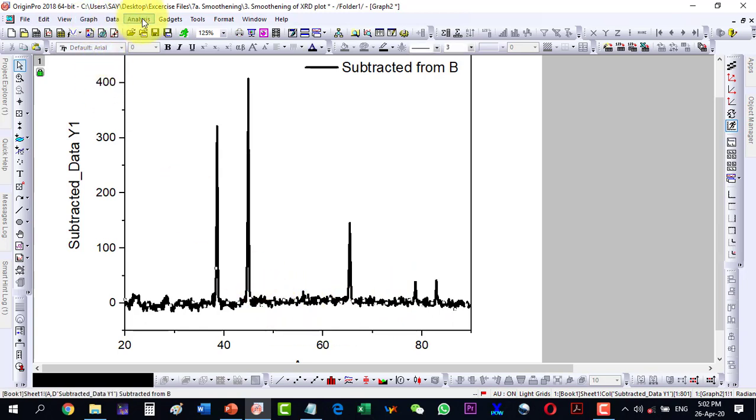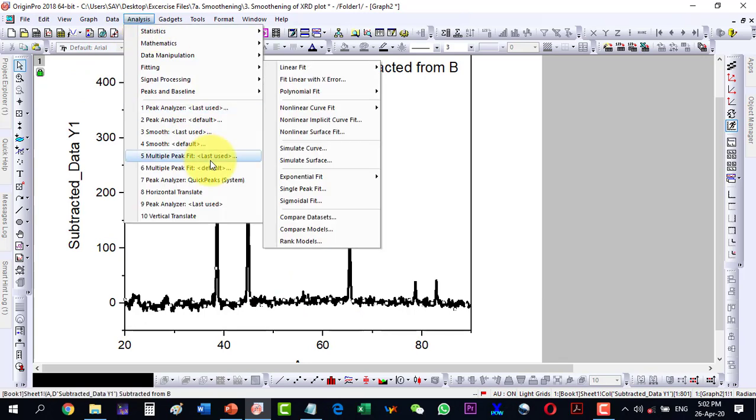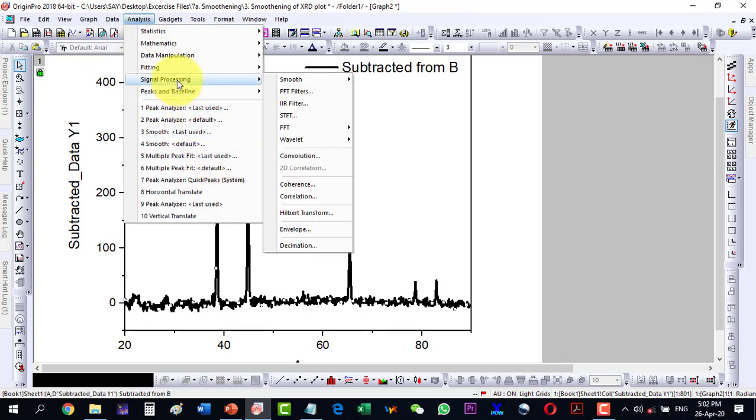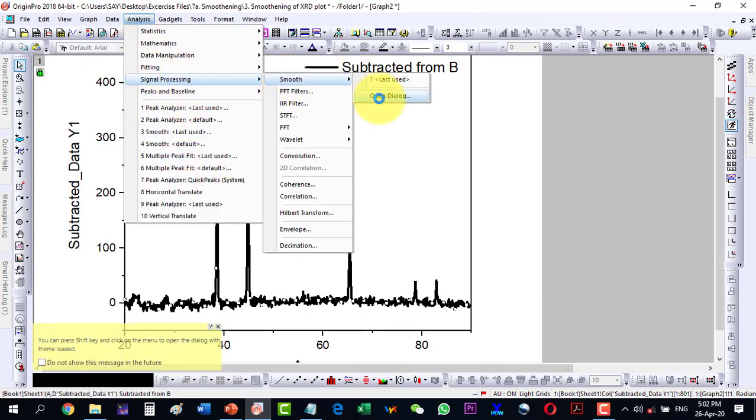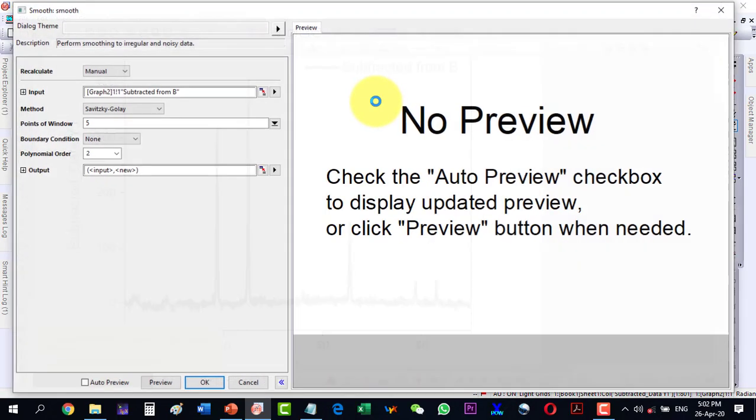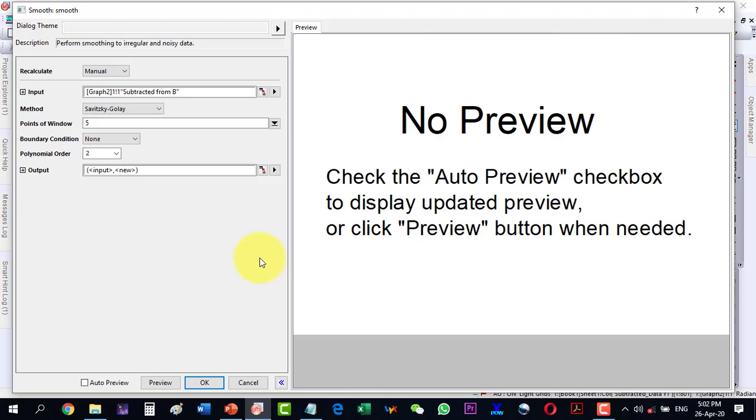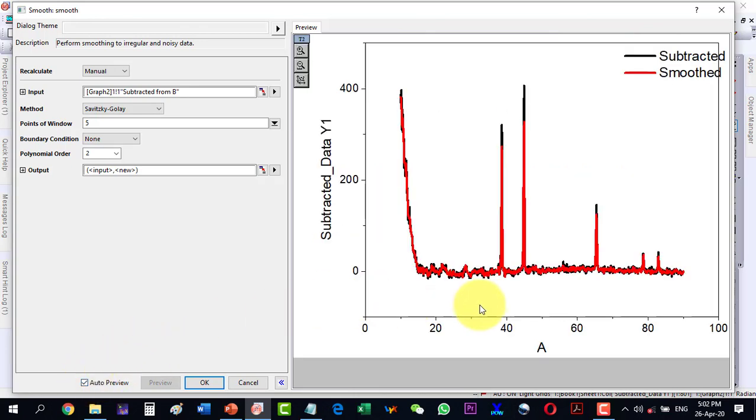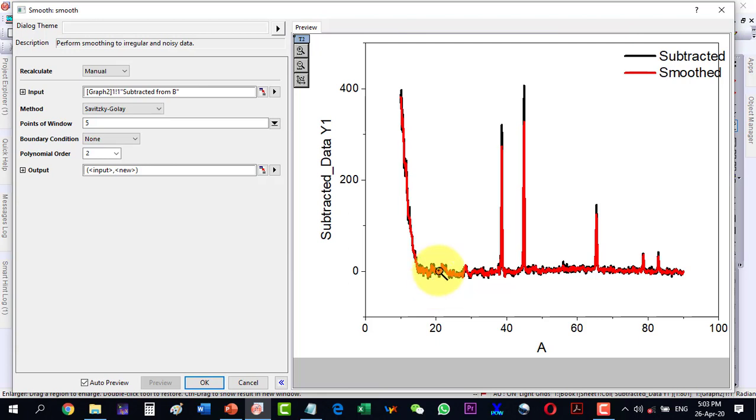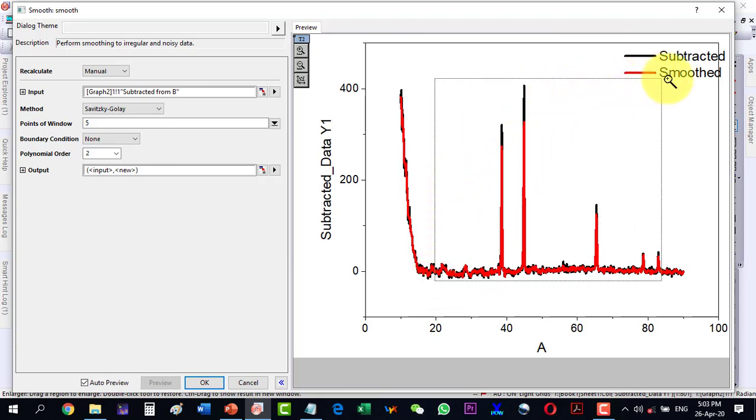And then go to Analysis, Signal Processing, Smooth, and then Open Dialog and Auto Preview this one so that it can show us the actual plot. Let me zoom the portion wherever I am interested. So I will only keep that range here up to 90.